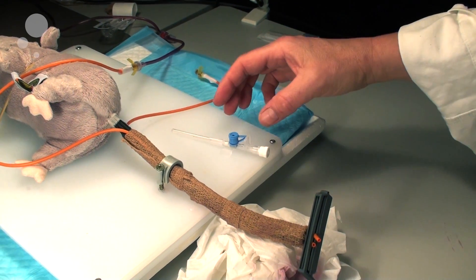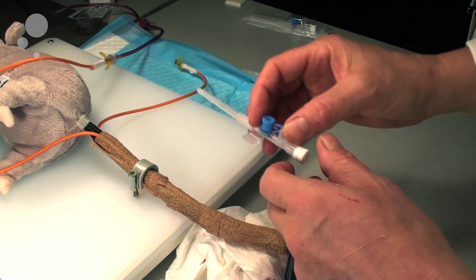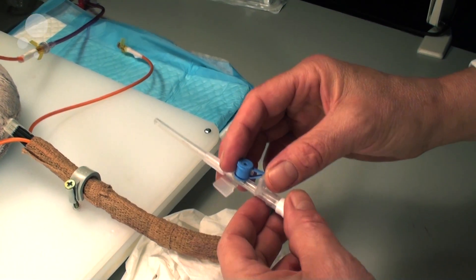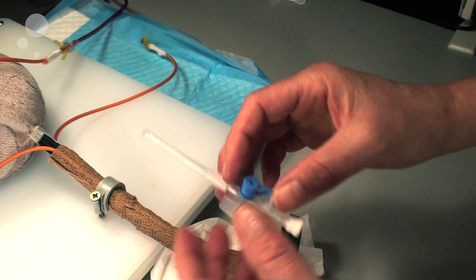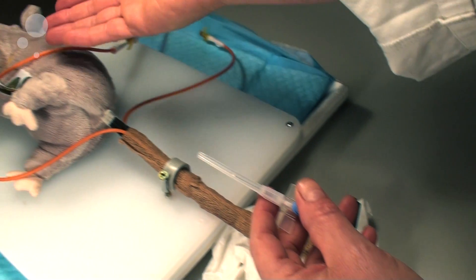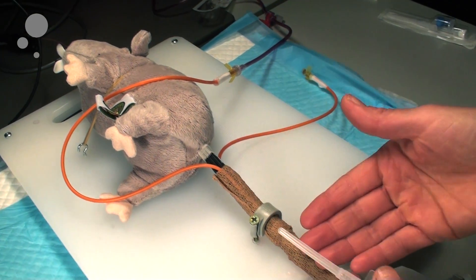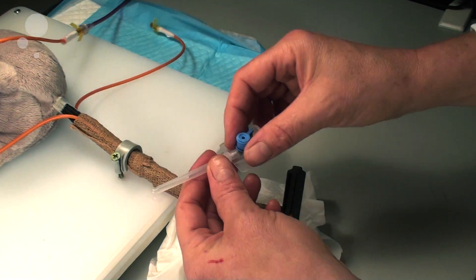Training the technique of tail vein catheterization in a rat can be done on one of the dummies. You have to ask one of the technicians to help you set up the system with the artificial blood flowing through the tail of the animal.